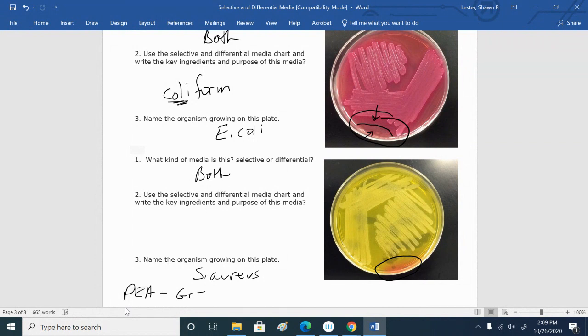Right, it's gram positive, because it selects for gram positive, inhibits gram negative. And so a gram positive would be growth, and gram negative, no growth, or slow growth, right? Because the inhibited organism may still grow, just more slowly than the one that's not inhibited.